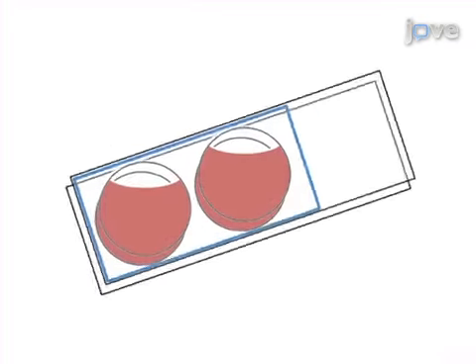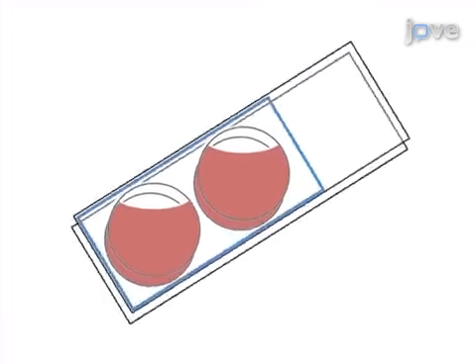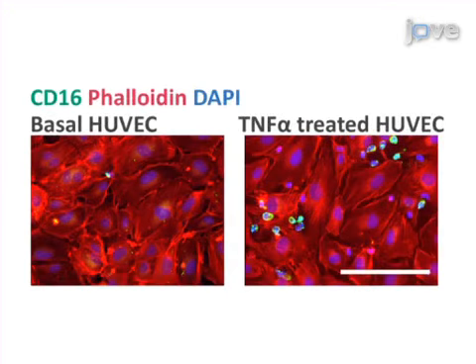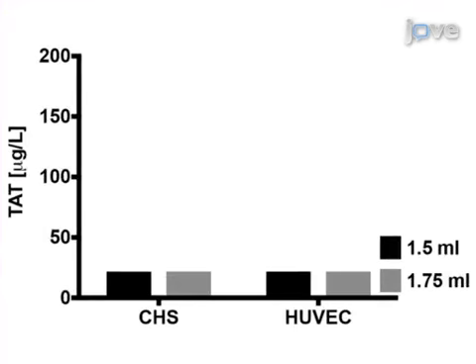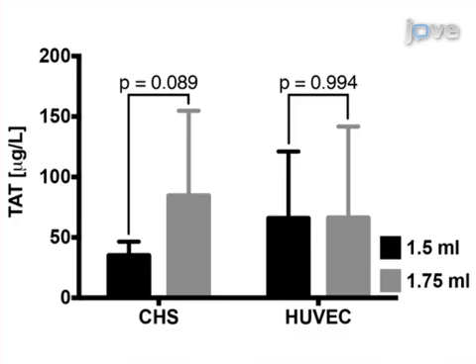Next, these blood endothelial cell chambers are gently rotated to facilitate the interaction between the blood and endothelial cells. Ultimately, the cell-to-cell interactions between the blood and endothelial cells and the resulting thrombin-antithrombin complex production can be assessed by immunofluorescence microscopy and ELISA, respectively.